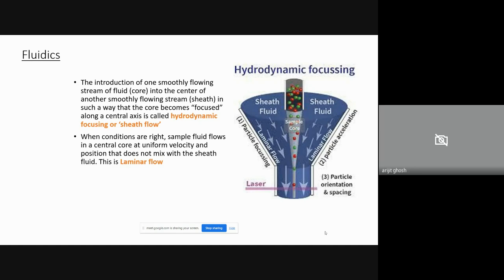So the sample fluid gets focused along a central axis of the sheath fluid, which is called hydrodynamic focusing or sheath flow.